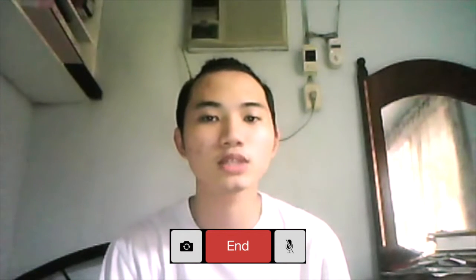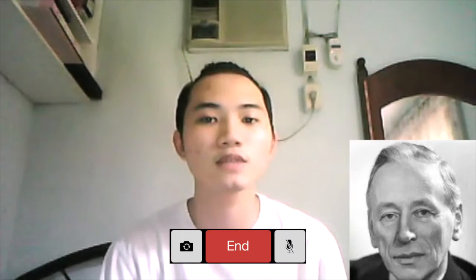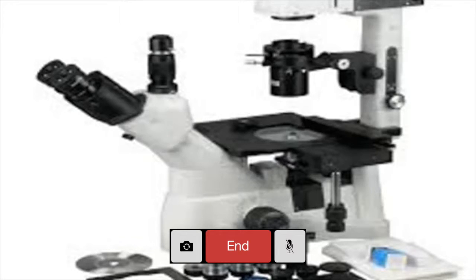In 1932, transparent biological materials were studied for the first time using Dutch physicist Fritz Zernike's invention of the phase contrast microscope. The phase contrast microscope is widely used for examining such specimens as biological tissues. It's a type of light microscopy that enhances contrasts of transparent and colorless objects by influencing the optical path of light. The phase contrast microscope is able to show components in a cell or bacteria, which would be very difficult to see on an ordinary microscope.